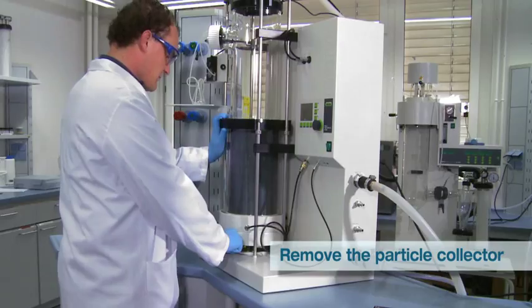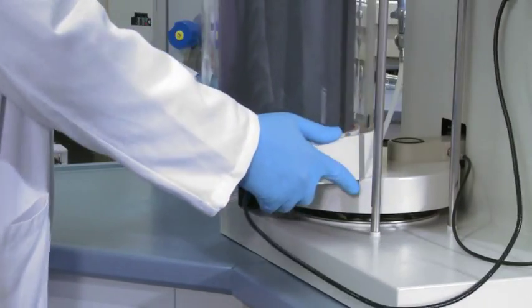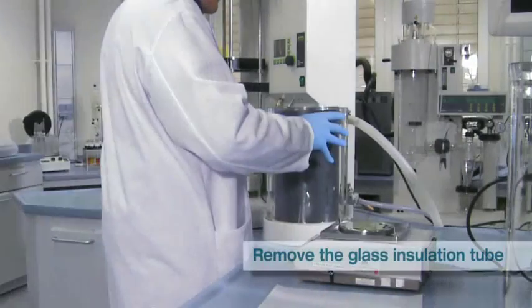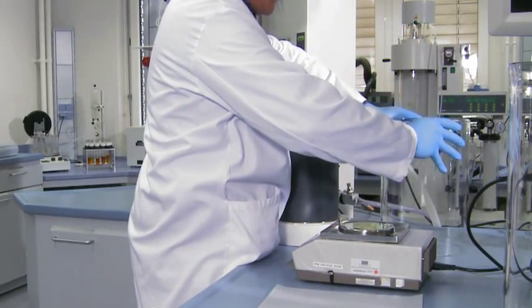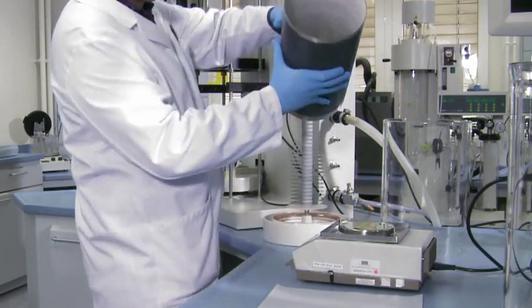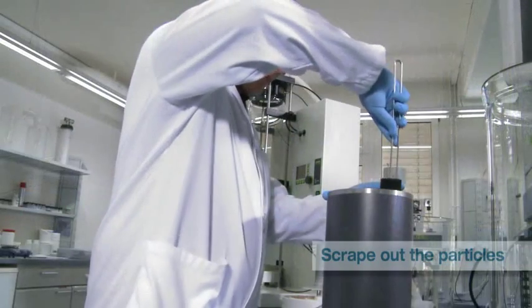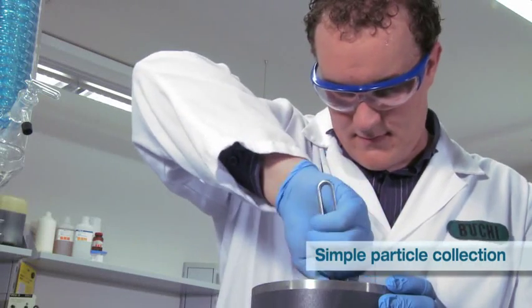To remove the particle collector, simply push the arm to the left and remove the insulation glass cylinder. Dismount the collection tube and place it on a piece of particle collection paper. Scrape the particles from the inner wall of the collection tube by using the particle scraper.